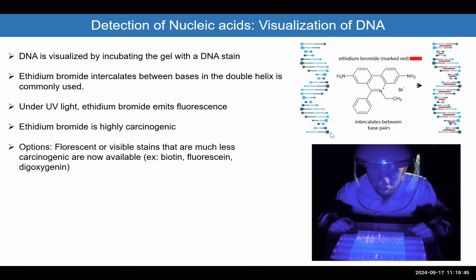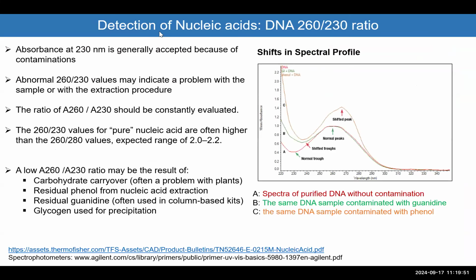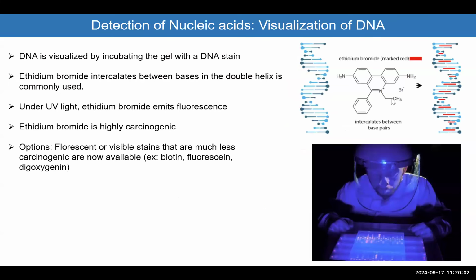But the idea is, why do we need these techniques? The nanodrop and the spectrophotometer can give you a quality of the concentration and the purity, but the electrophoresis and running the DNA on a gel where it can be visualized, it can give you a good value of if the DNA is degraded or not.